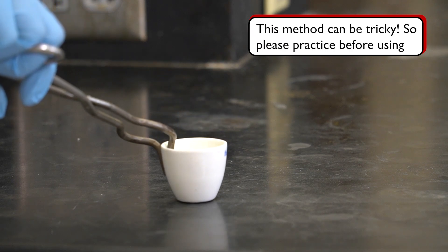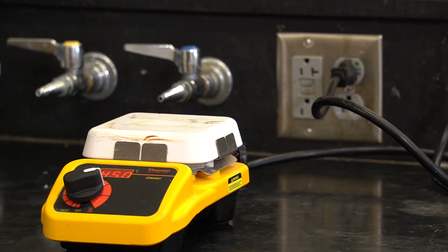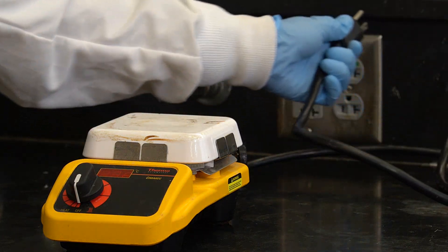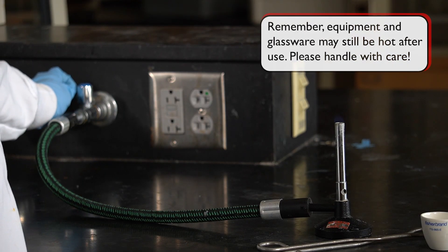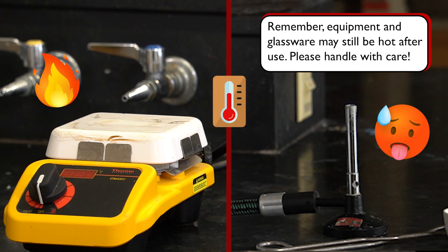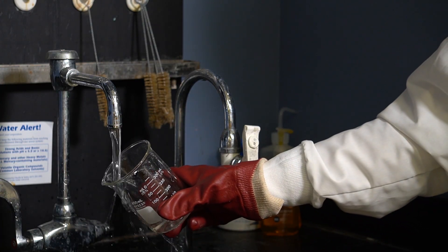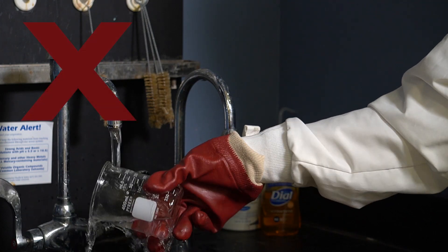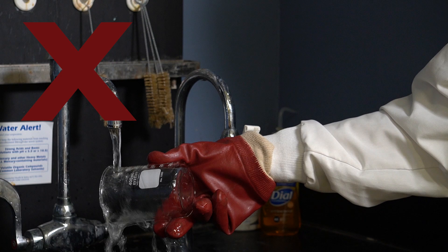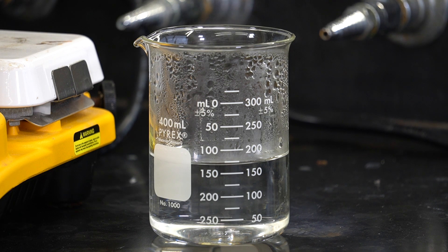The recommended way to handle a hot crucible is to grab it on the side using the tip of the crucible tongs. Practice before your actual experiment to avoid accidentally breaking the crucible and spilling a reaction. Once you've moved the hot glassware away from the heat source, remember to always turn off the hot plate and put out the Bunsen burner. Keep in mind that the glassware, hot plate, and burner will still be hot for some time, so please work with care.